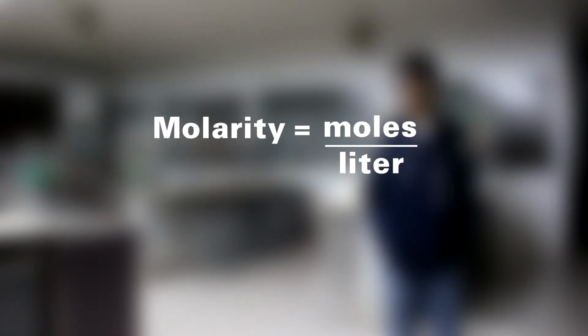And for today, I will be preparing a copper 2 sulfate solution and a HCl solution. Furthermore, I will be calculating their molarity or moles per liter and their percentage by volume.